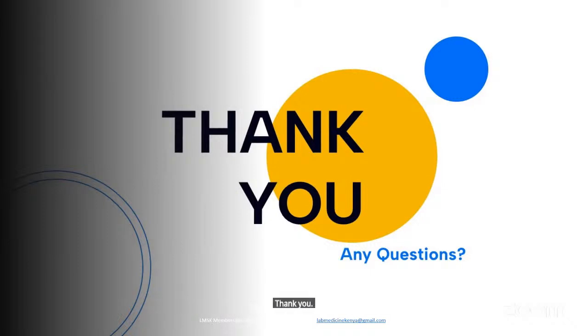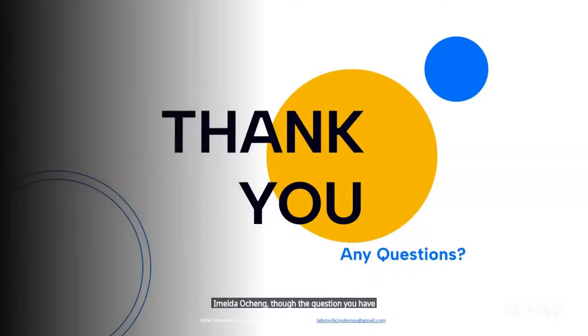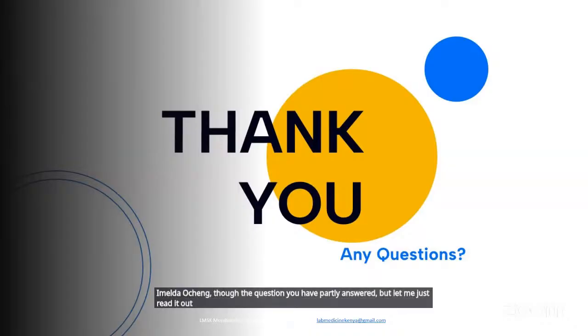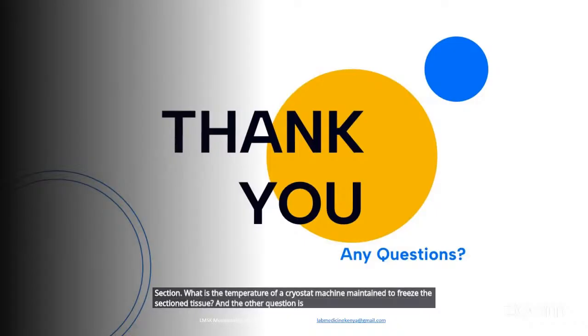Thank you, Christine. Welcome. The last question here on the chat as we wind up. Imelda Ochieng, though the question you have partly answered, let me just read it out. When using a cryostat procedure for frozen sections, what is the temperature of a cryostat machine maintained to freeze the section tissue? And the other question is, what is the freezing agent used?